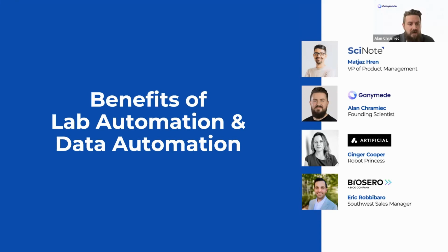Some of them, though, are less obvious on the benefits side, but I think just as important. So there's a certain level of standardization that comes with automation, and that's a bit of a double-edged sword. Maybe we'll talk about it later in the webinar. And that standardization will yield higher reproducibility. And that's the linchpin of any successful biotech or life sciences endeavor or scientific endeavor. And it's something that's often overlooked. People are usually focused on the how do I scale things up side of things. But you have to maintain both quality and quantity, right?